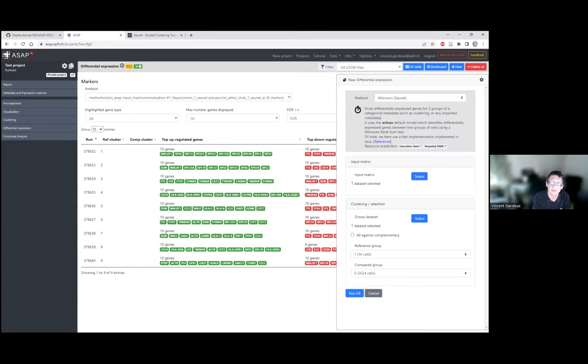that you actually selected. So that could be useful when the clustering doesn't really match what you want to see, which happens very often, sadly. But yeah, so that's a way to focus on some specific cells that may not be readily visible in your clustering.